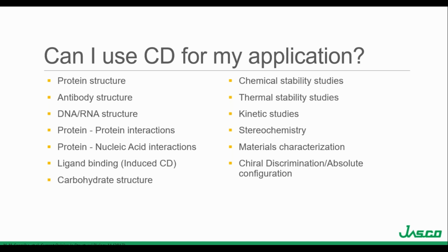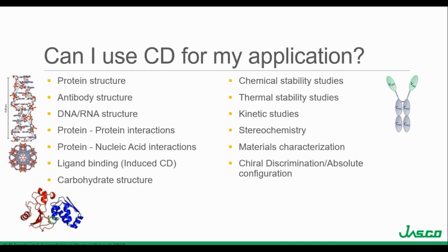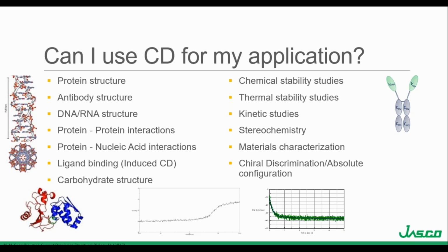There are a wide range of CD applications, from protein structure to antibody structure, DNA and RNA structure, protein-protein interactions, protein nucleic acid interactions, ligand binding, induced CD, carbohydrate structure, chemical stability studies, thermal stability studies, kinetic studies, stereochemistry, materials characterization, and chiral discrimination and absolute configuration of small molecules for drug therapy and design.